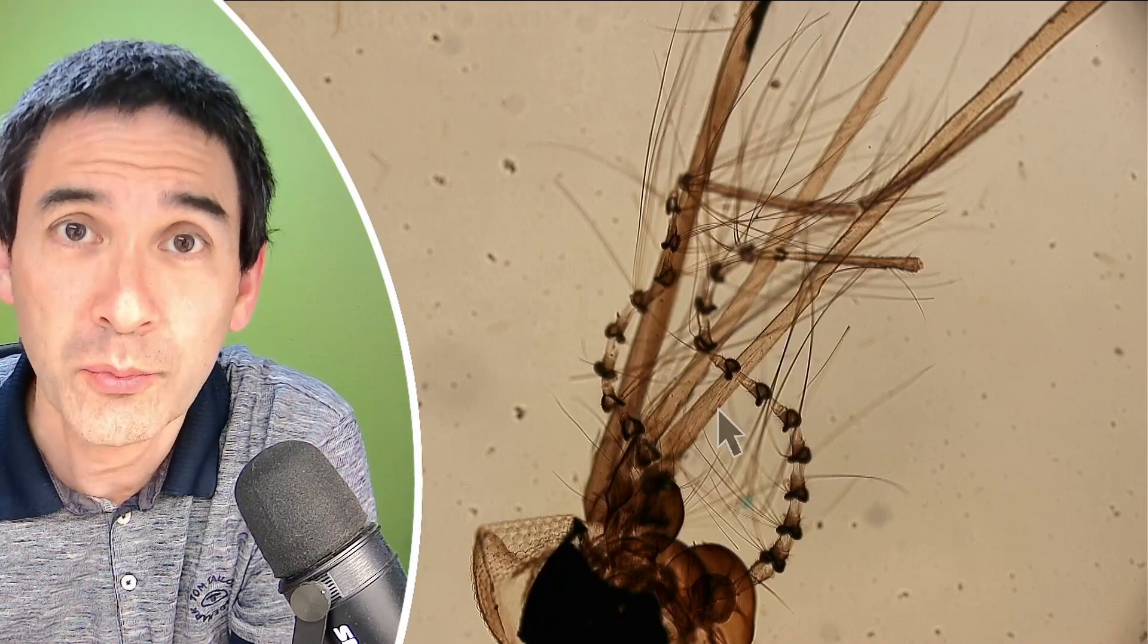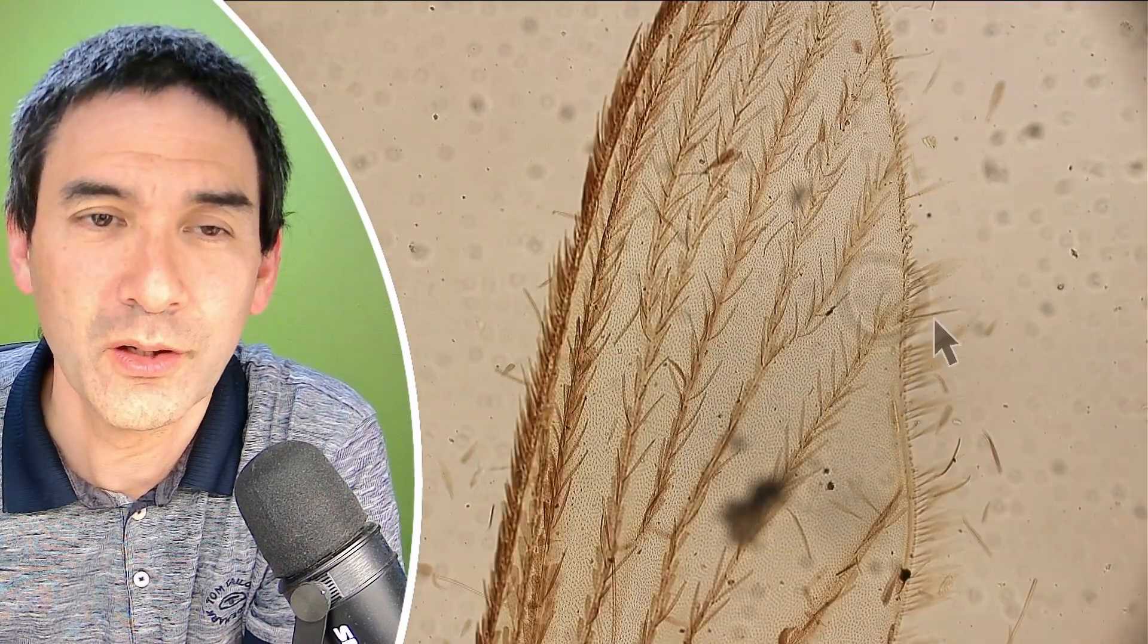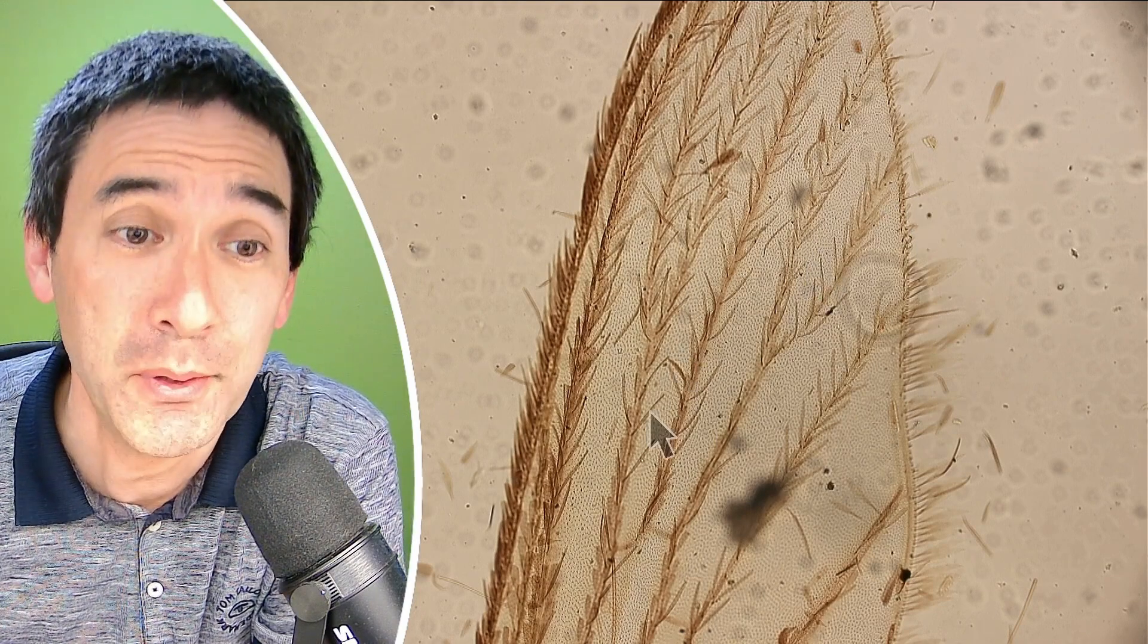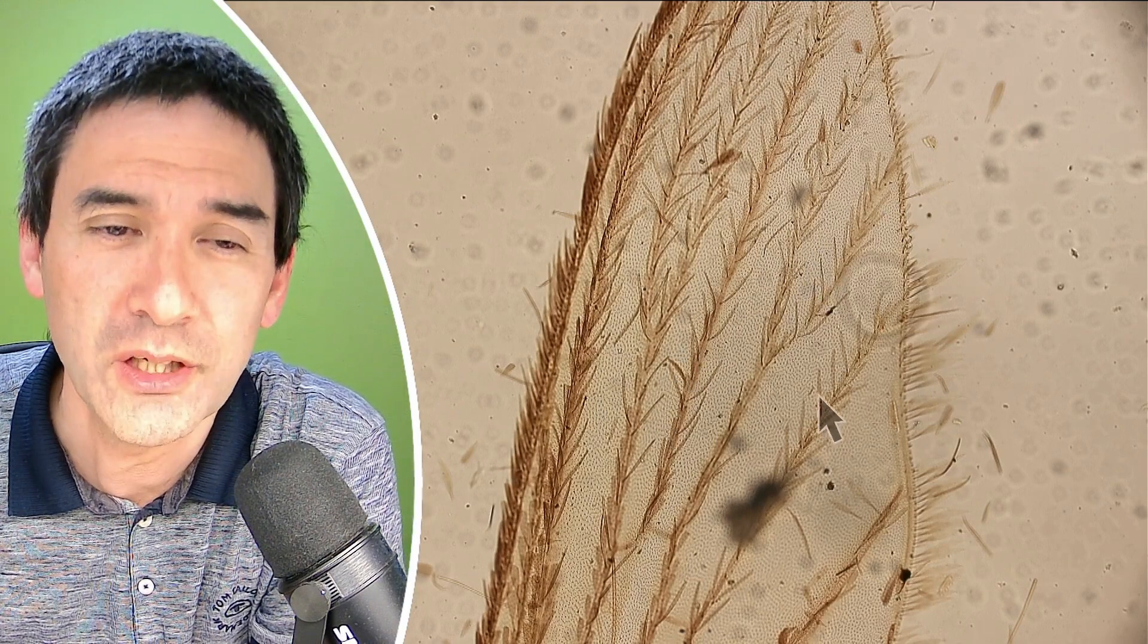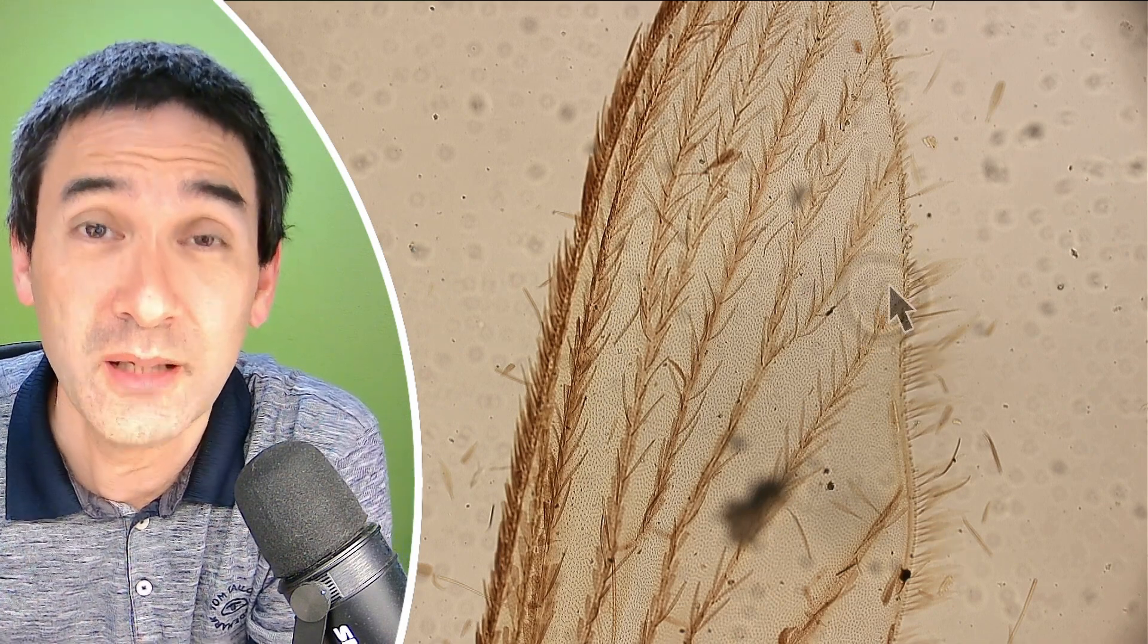Now let's have a look at the wings of a mosquito so that we can also see a difference. So that is now the wing. And we can see over here, there are these fine little scales that remind me a little bit of the scales of a butterfly, just a little bit more narrow. But these are the things that I was not able to find in a midge.